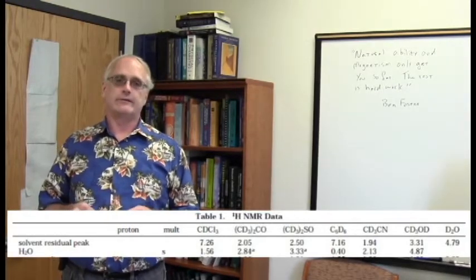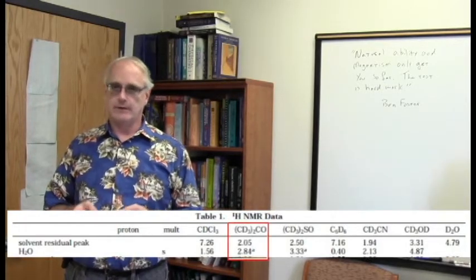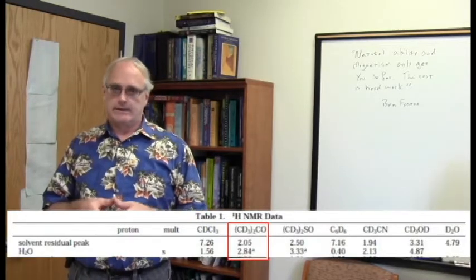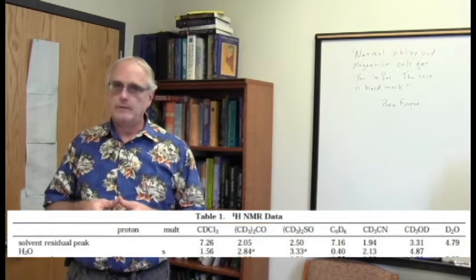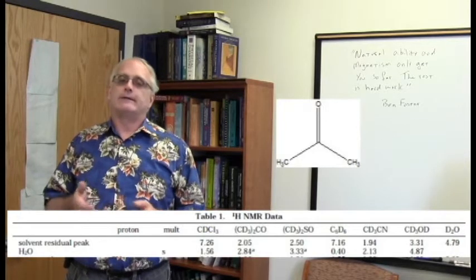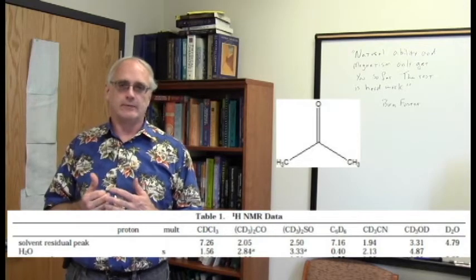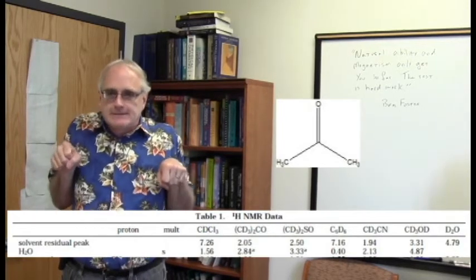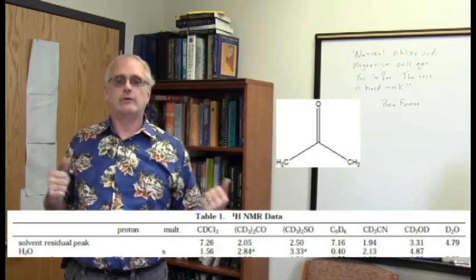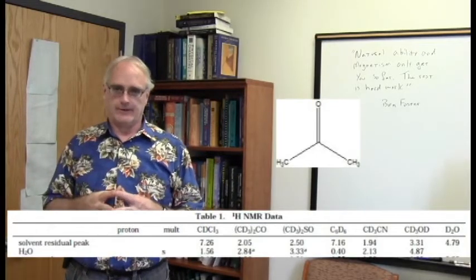But now consider the chemical shift of water in a solvent like acetone, around 2.8 ppm. It's considerably downfield from the value we saw in benzene, though it's not nearly 4 to 5 ppm. Acetone is a polar solvent, but it's not a good hydrogen bonder. I interpret it this way. We essentially now have water molecules in a somewhat more friendly environment. The hydrogens, instead of being tight to the oxygen and buried in its electron clouds, with the polar acetone molecules around it, are being pulled out a little bit, de-shielding them some.